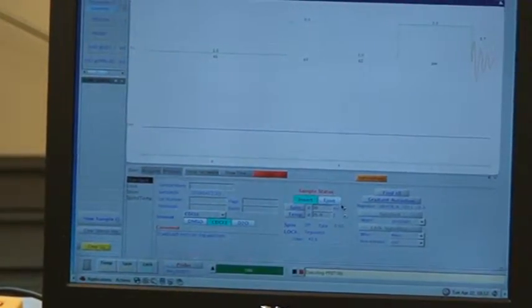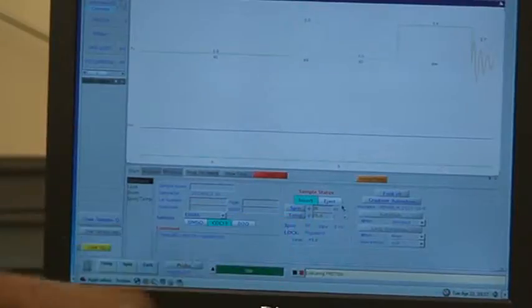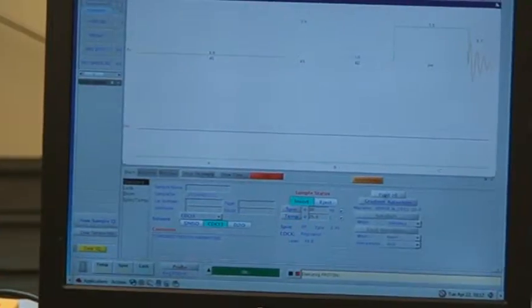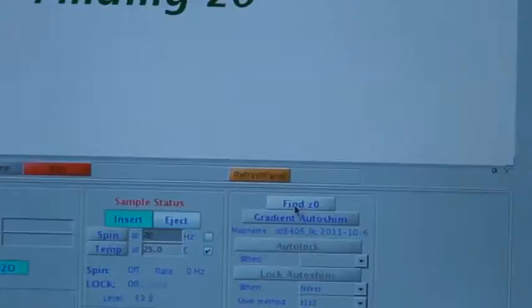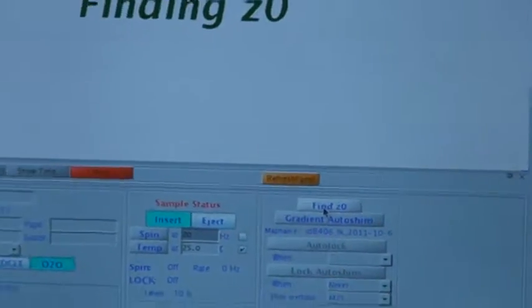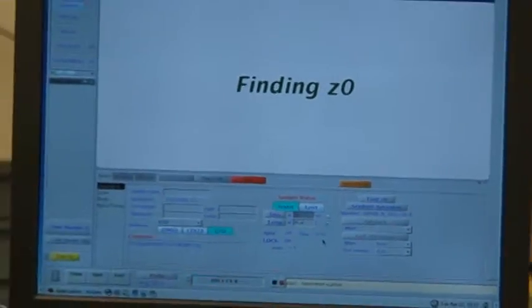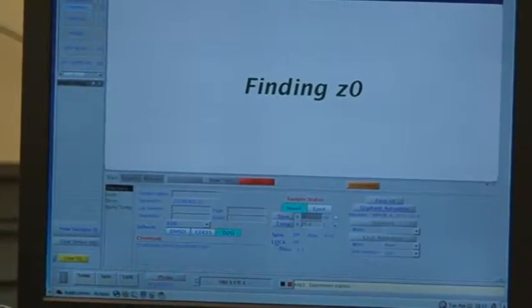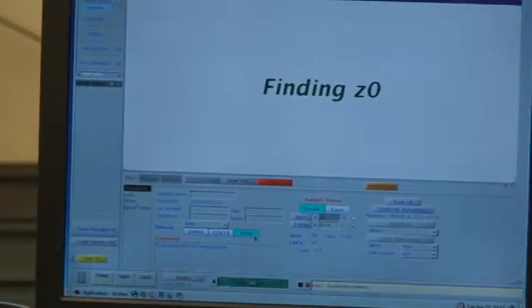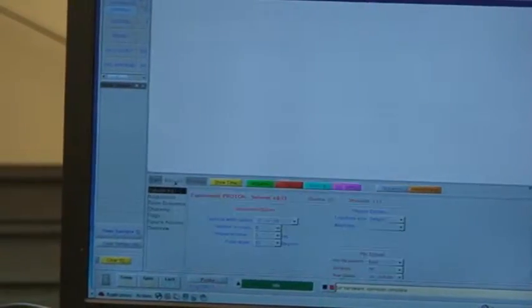After we get done choosing the correct parameters, we click on Find Z0. After we find Z0, which is kind of like the standard, we then go to Acquire.